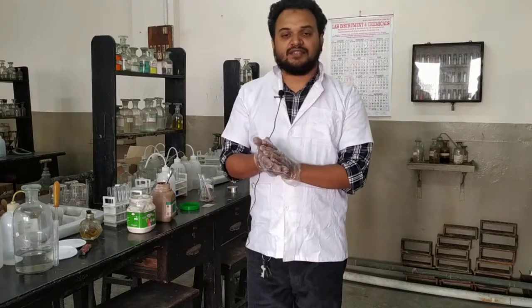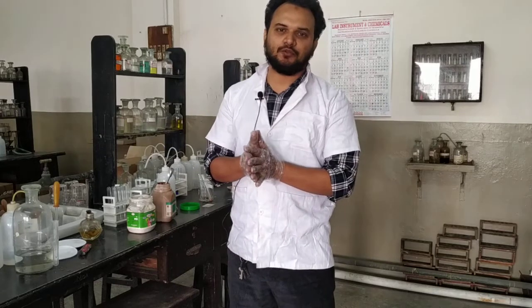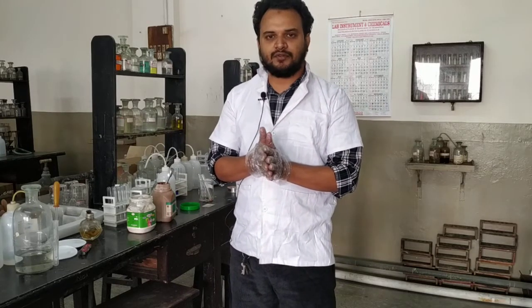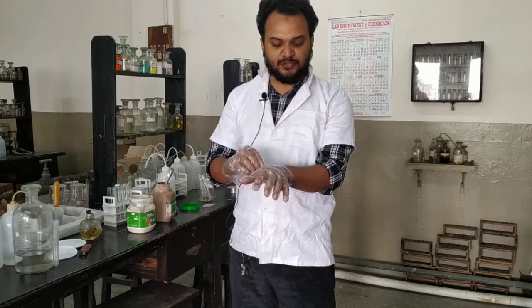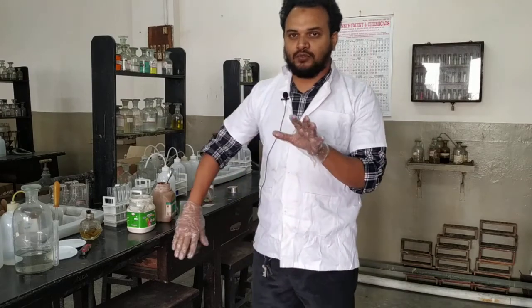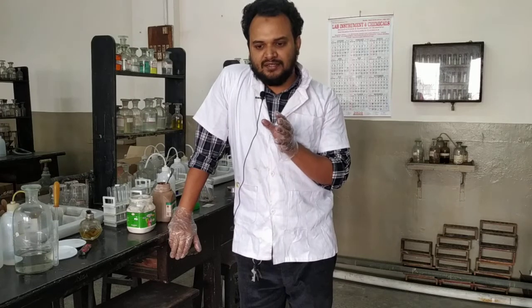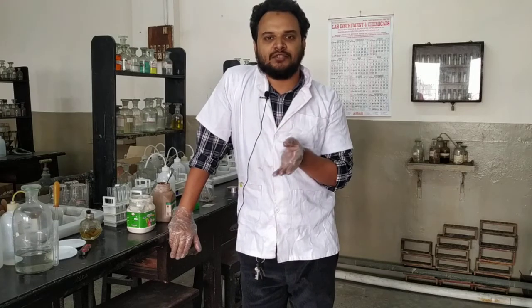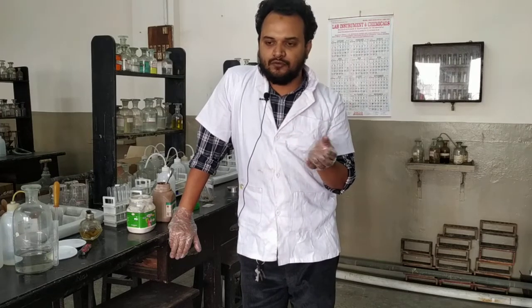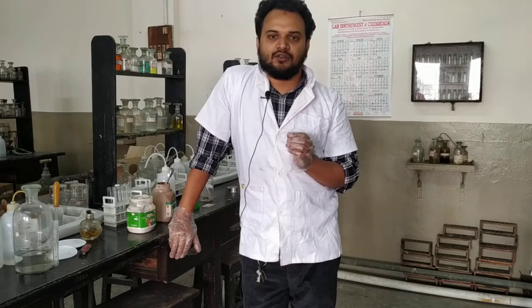Okay, so next test, again a familiar test, that is Tollen's test. Since it is an aldehyde group, that is Tollen's test. And for biomolecules, for carbohydrates, even some ketones are also there which can give a positive Tollen's test. The only problem is using Tollen's test you cannot distinguish between an aldose and a ketose. For example, if I take glucose and fructose, glucose has an aldehyde group and fructose has a keto group, and we know ketone does not give the Tollen's test.